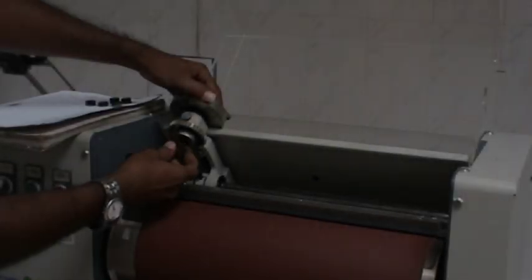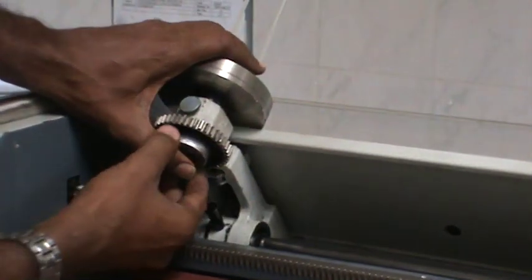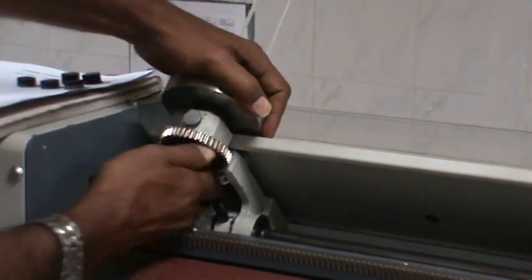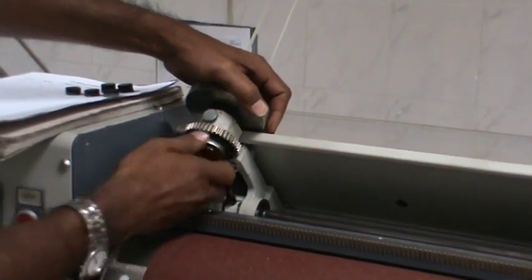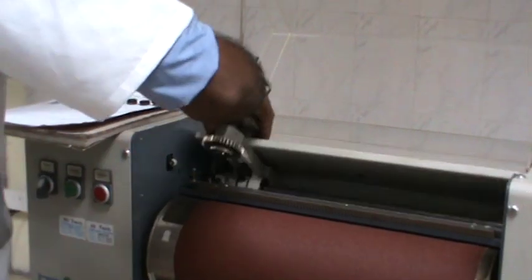E. Abrasion resistance. The abrasion resistance of rubber is measured by taking a round plug sample and passing it over a rotating abrasive drum. The volume of the rubber sample is measured at the beginning and end of the test. The difference in the rubber volumes is called the amount of rubber loss, measured in cubic millimetres. The lower the number, the more resistant the rubber is to abrasion.